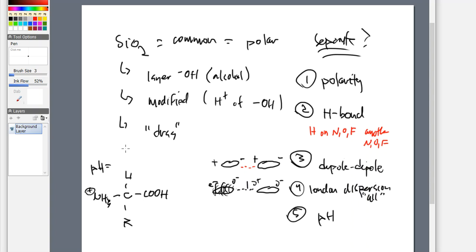So that carboxylic acid is an acid, but this carboxylic acid group will only spin out the proton after we go above a certain pH. So at pH of 1, it's COOH. Nothing fancy happens here. And that COOH group could maybe participate in a hydrogen bond, because that hydrogen's attached to an N, O, or F. And if it sees another group, absolutely, like silica, woohoo! All right, well, here we go.